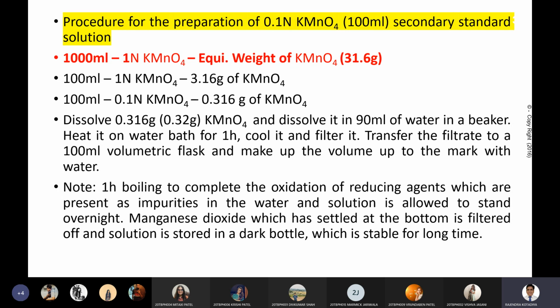And that is our secondary standard solution કે જેનું આપણે સ્ટાન્ડર્ડાઇઝેશન કરવાનું છે. So why standardization is required એ આની પછી સ્લાઇડમાં આવશે. Okay, just focus on this procedure part first. Now we'll do the standardization and then we'll discuss out the actual principle.